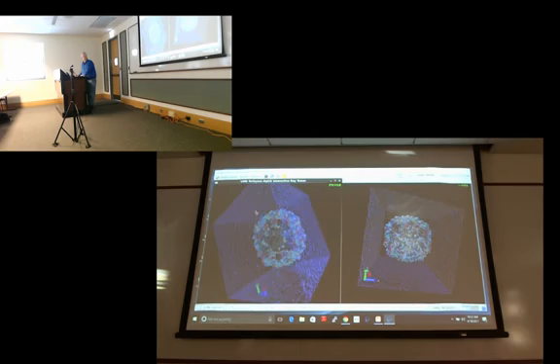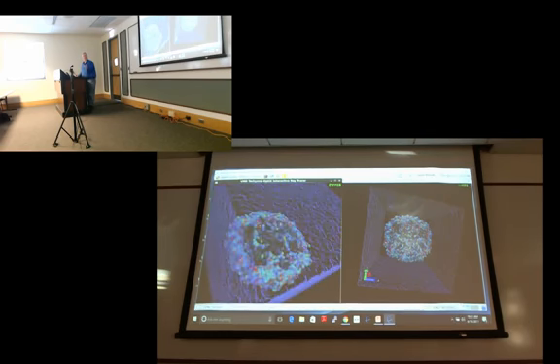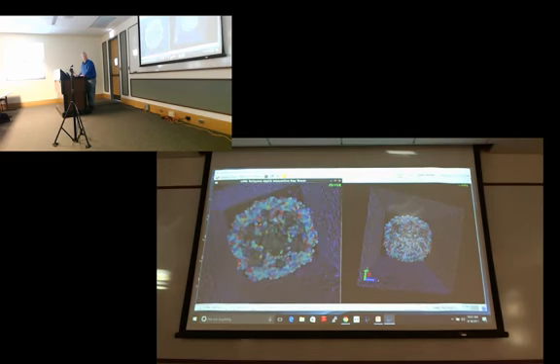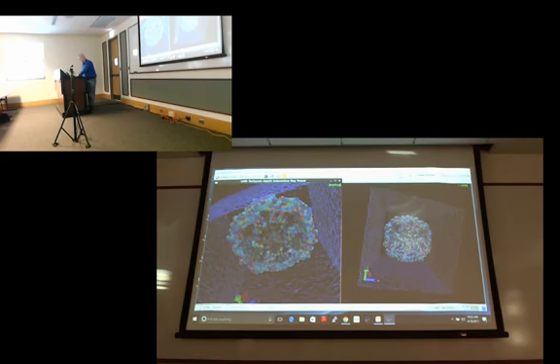And so this is what I was describing before. This is the key technological advance. We had ray tracing 20 years ago, but it took a minute to generate an image, and you couldn't see any intermediate result. Now, with the advent of GPU-accelerated rendering for ray tracing and the newest CPUs, we have hardware that's fast enough we can actually do this interactively, just like we would with OpenGL.